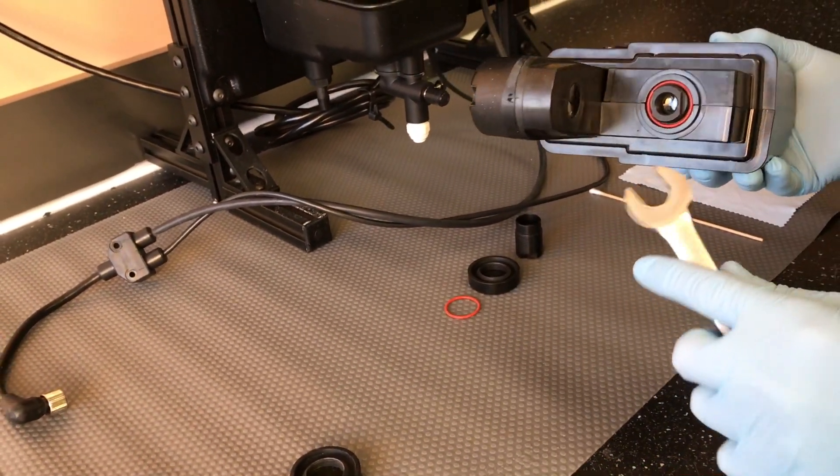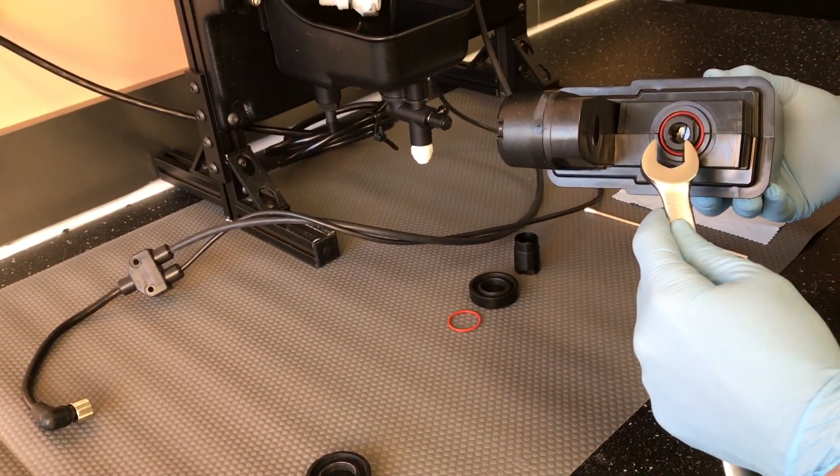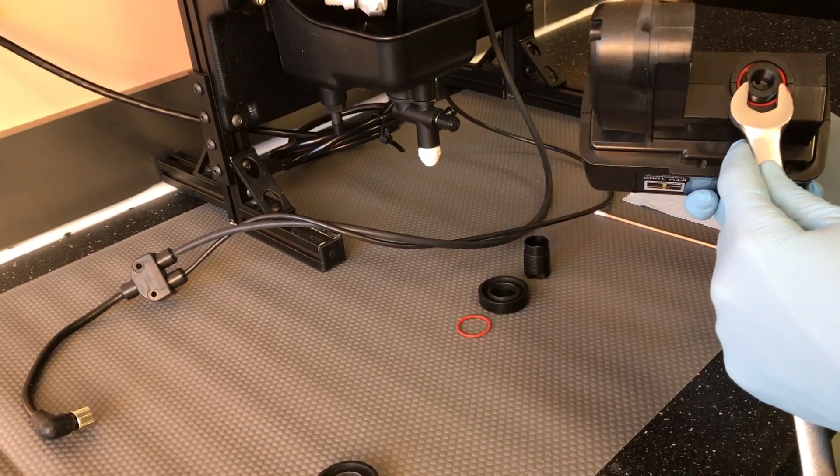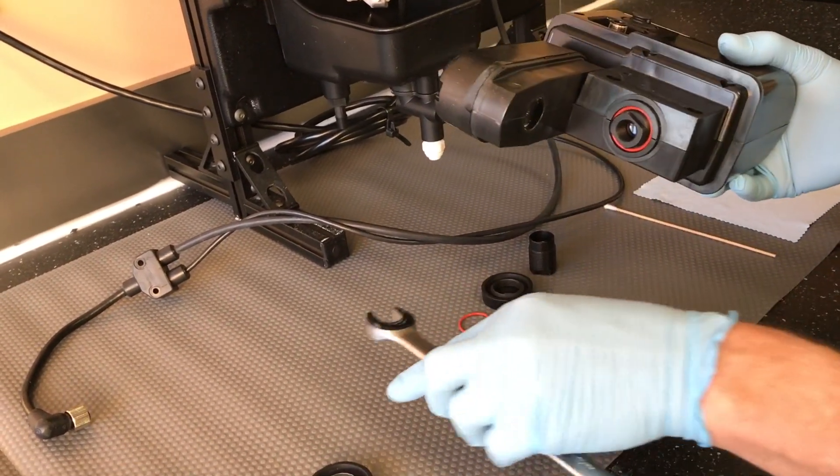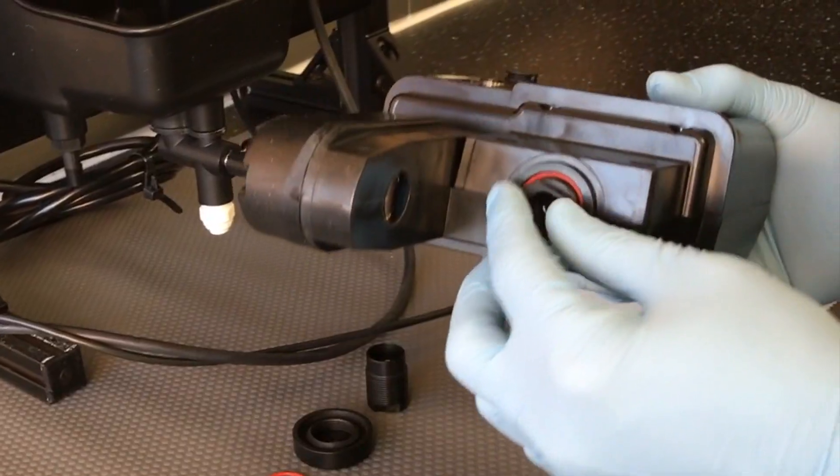Using a wrench, gently loosen the threaded stud which is protruding from the measurement module. Loosen further by hand.